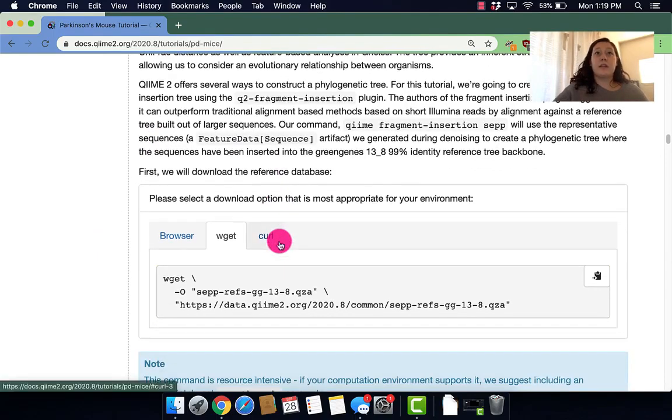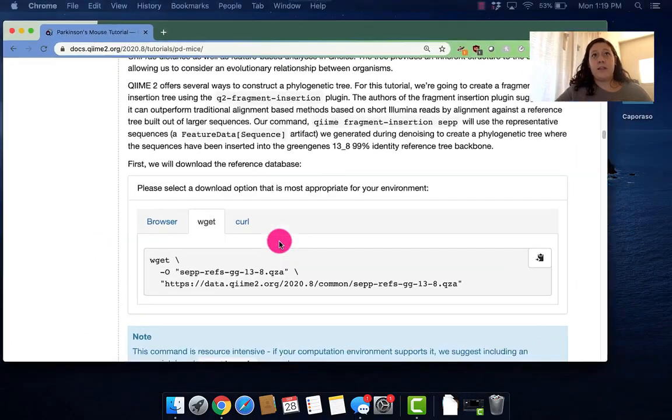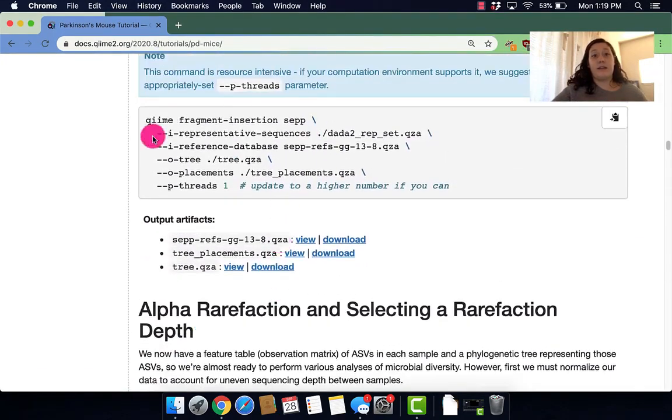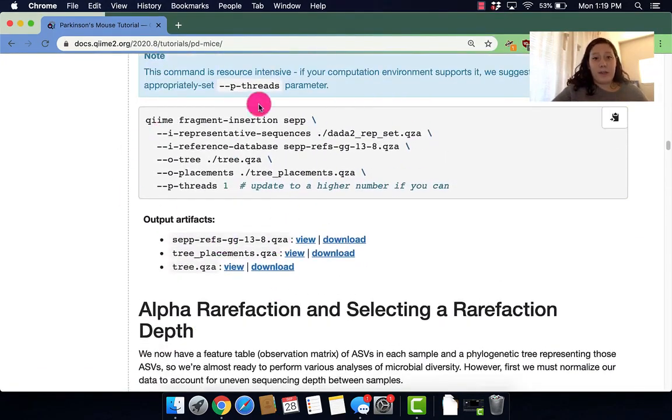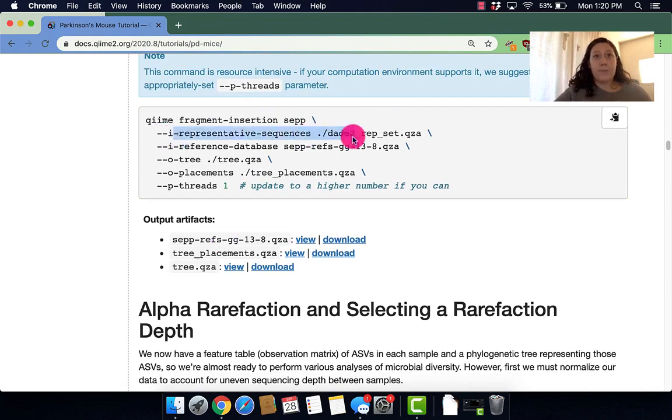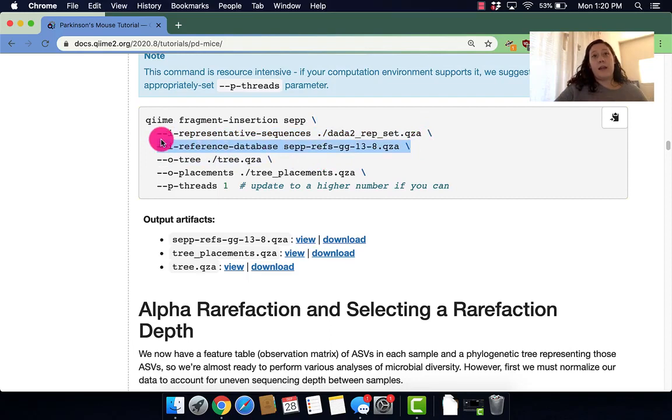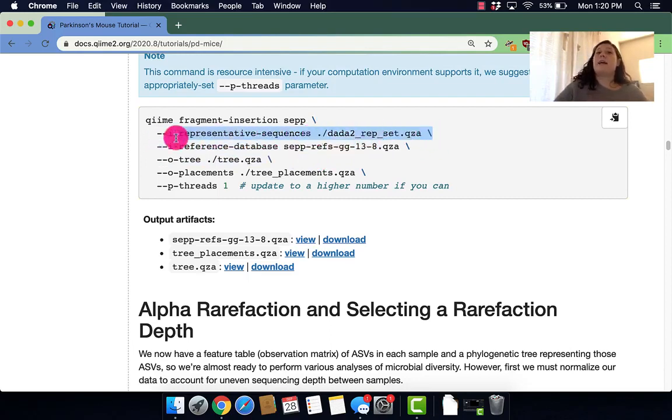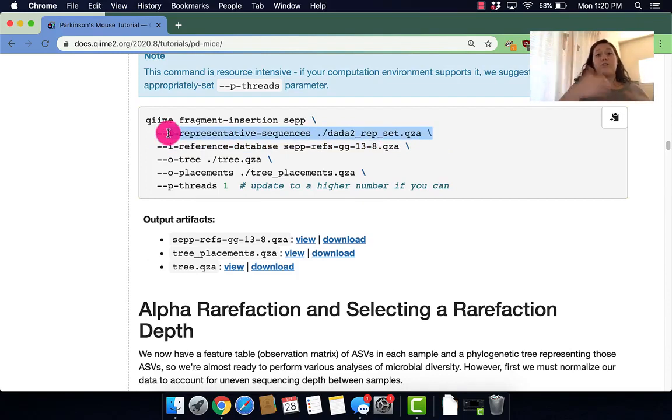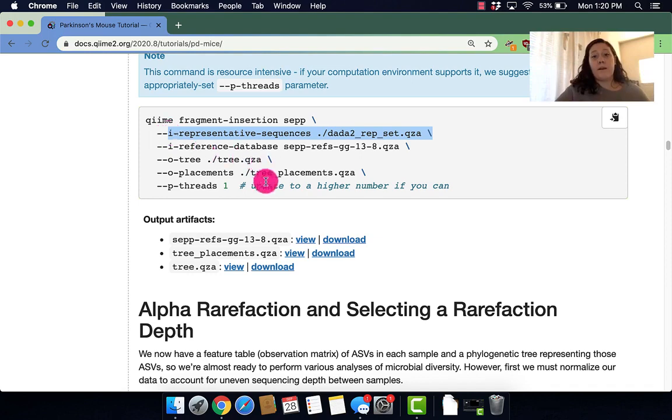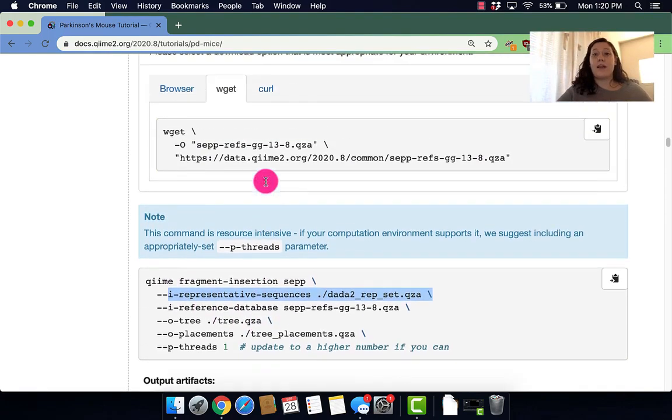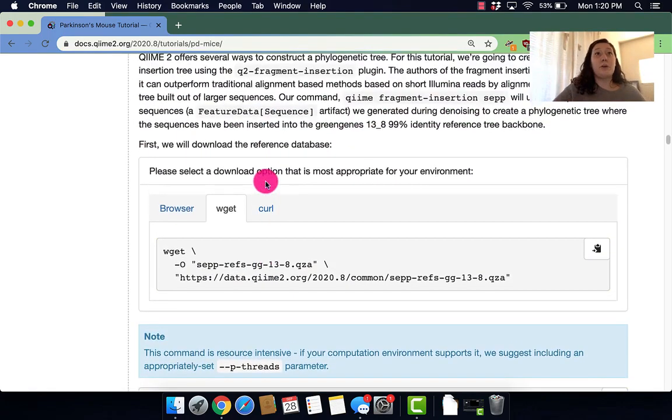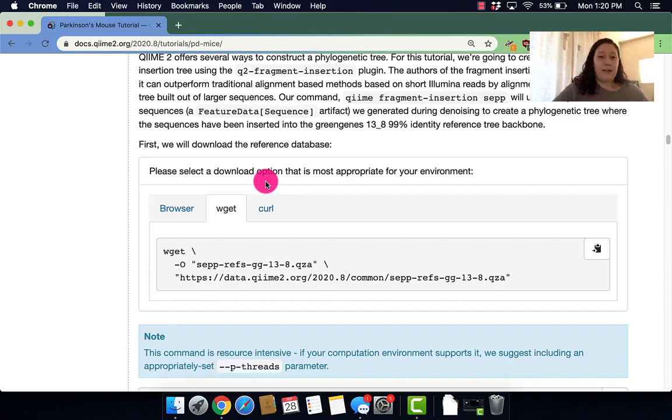There's a couple of ways to make a phylogenetic tree. In this tutorial we're going to be using fragment insertion. Basically what this does is it takes a reference tree and then it takes our sequences that we give it and tries to align those sequences to the reference tree and then insert them based on that. So now that we have a little idea of what we're doing, why we're doing it, let's start by running the commands.